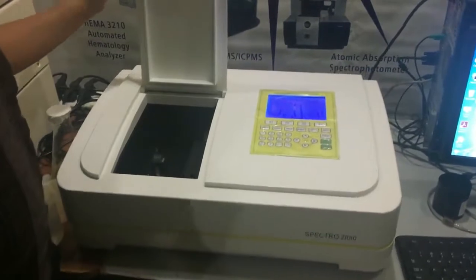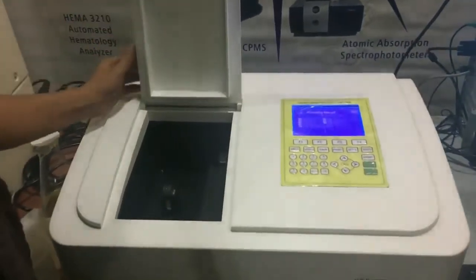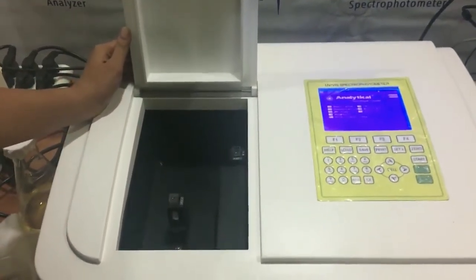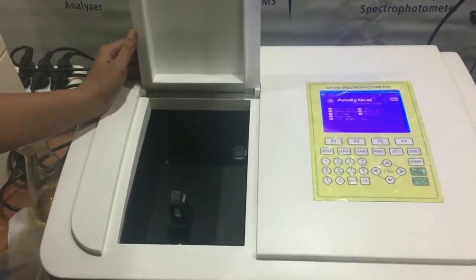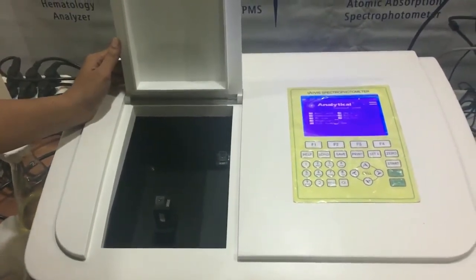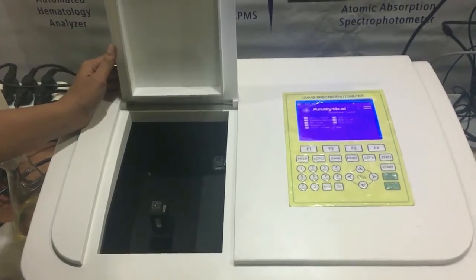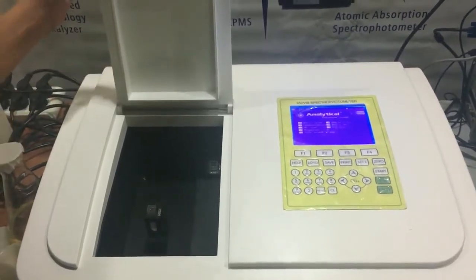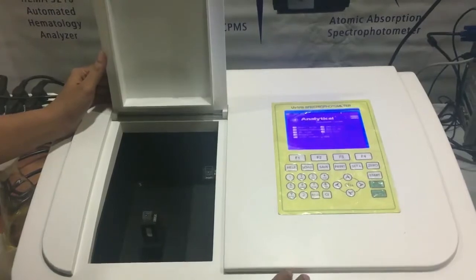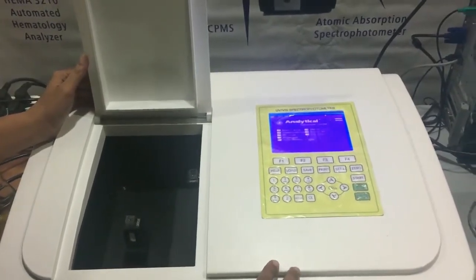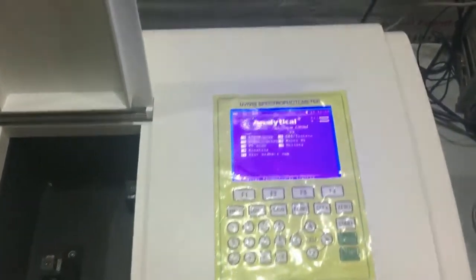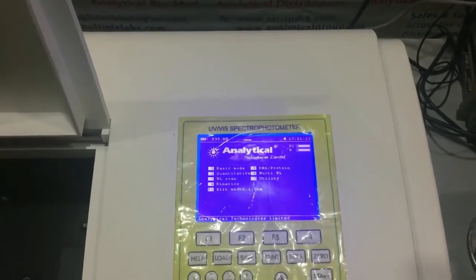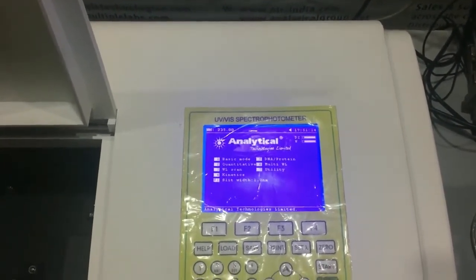In the sample window there are two lamp sources and two sample cuvette ports to analyze the concentration of the sample simultaneously. In the display window we can see various options for basic mode: single wavelength, multi-wavelength, and DNA/protein analysis.